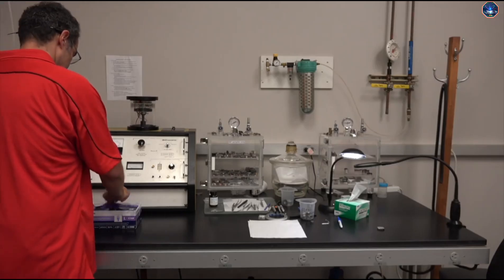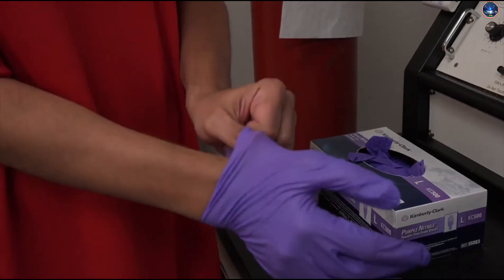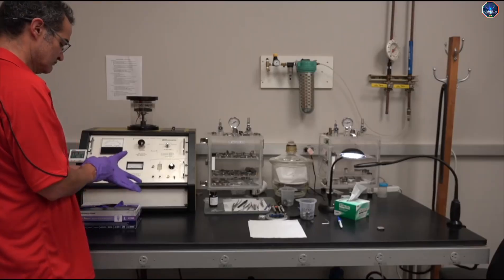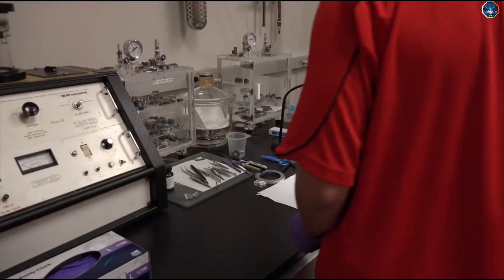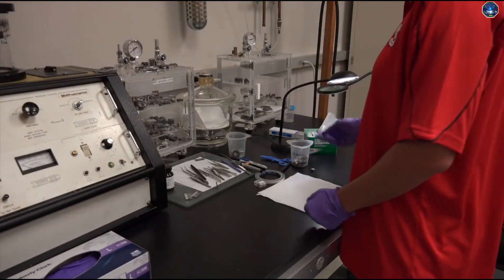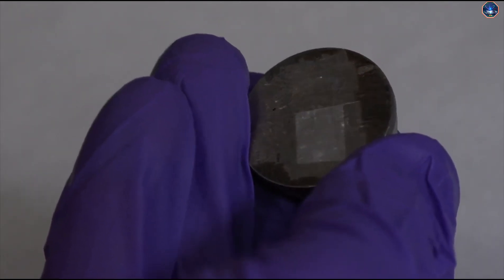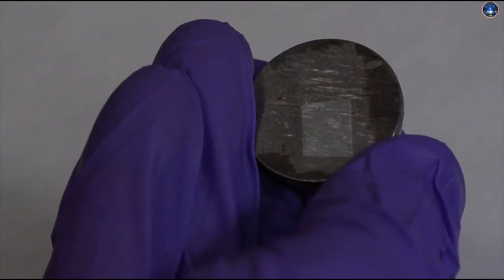Make sure you are wearing gloves. This is to protect the sample from getting contaminated by oils and dirt from your hands. The sample must be placed on a mount that is compatible with the SEM you are using to perform the experiment. In this case, we're going to attach our sample onto a Hitachi screw mount, which can fit into our Hitachi microscope.